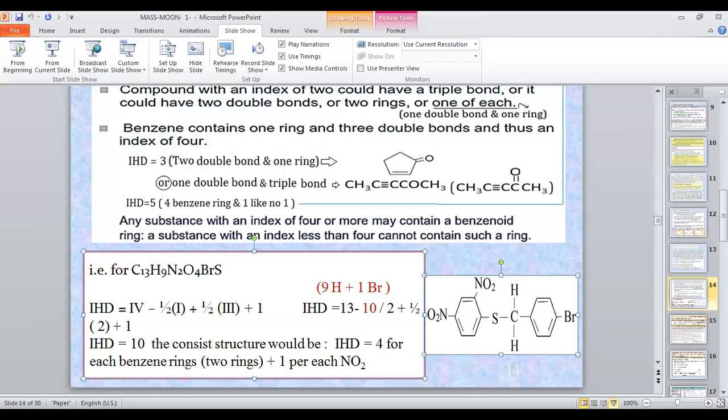I said before that in case I have a type of isotope, in case of bromine or chlorine or iodine or fluorine, fluorine will give me a peak which is related to M-19, iodine will give a peak which is equal to M-127. And in case of iodine, I am going to find a large gap between the molecular ion and another peak rather than the peak that is related to iodine. What about sulfur? Sulfur also gives me the same case as halide, giving 2 peaks which are related to M and M+2. So how can I know that I have sulfur rather than halide?